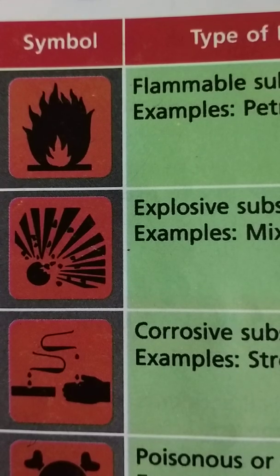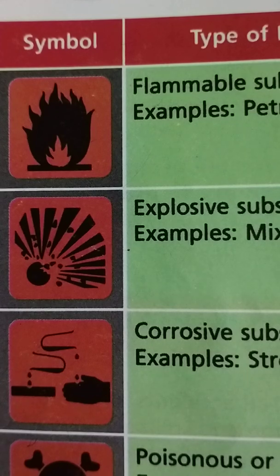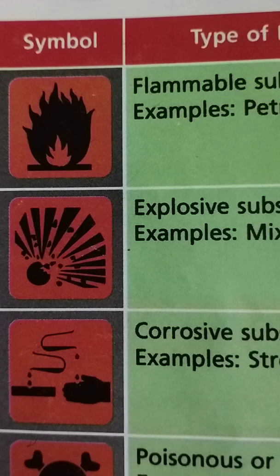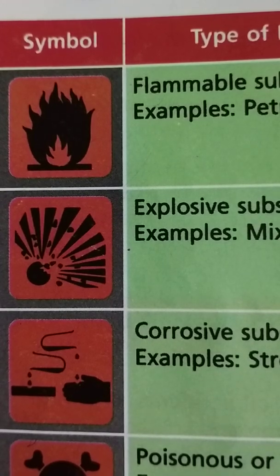The third symbol is used for corrosive substances. Corrosive substances are those that will damage or destroy other substances they come into contact with, by means of a chemical reaction. Examples include strong acids and alkalis. Avoid direct contact with corrosive substances as they can cause burns. If acid or alkali spills on your skin or clothes, wash it off with plenty of water immediately.